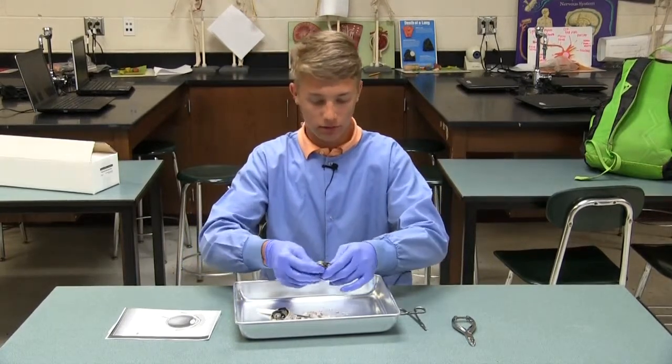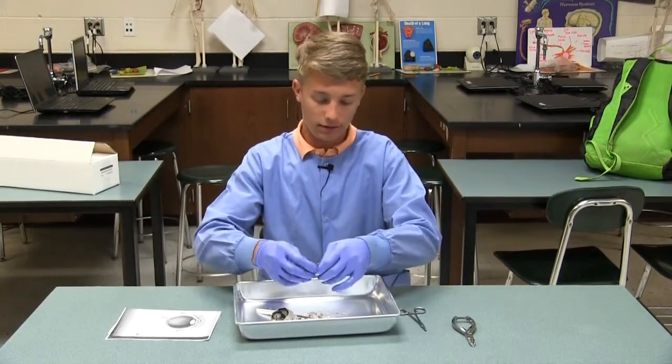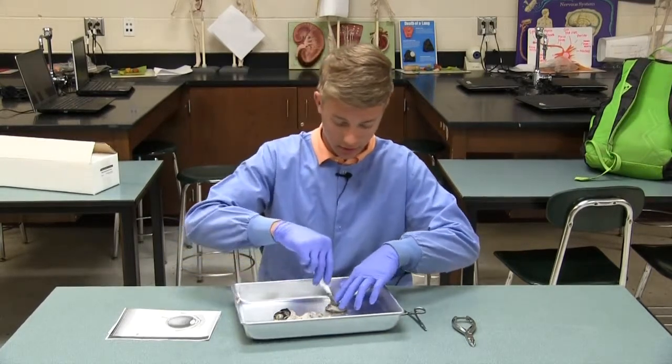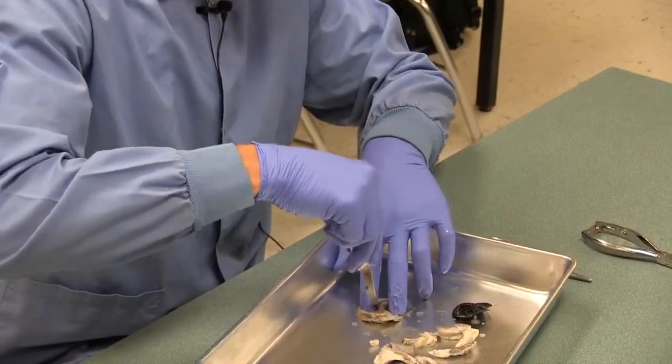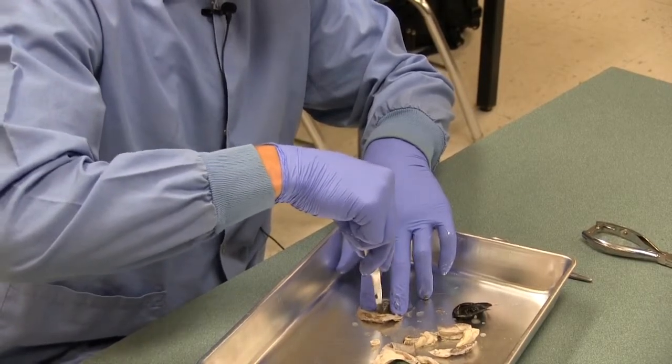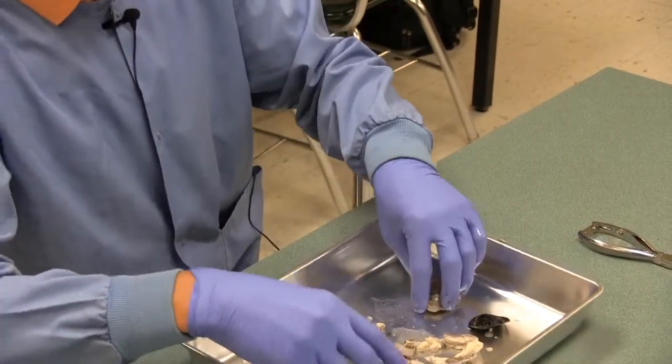Just to give you an idea of the layers of the cornea, if you listen closely, you can hear me cutting through the different layers. It sounds like glass, kind of. Those are the layers of the cornea there that serve to protect the eye.